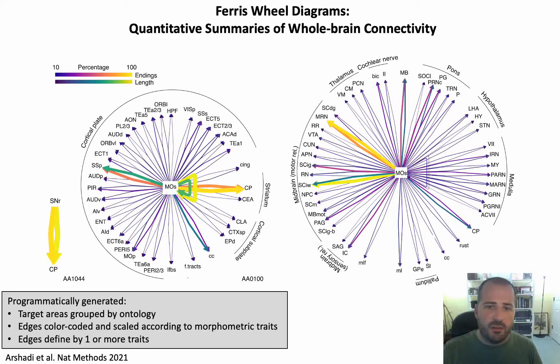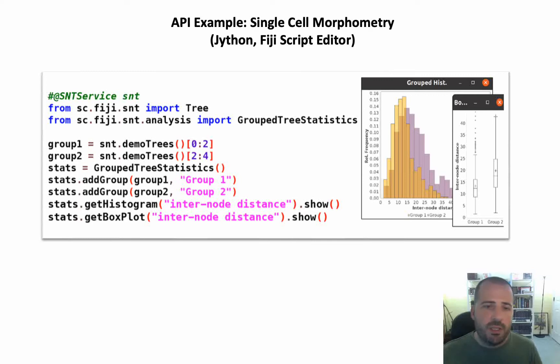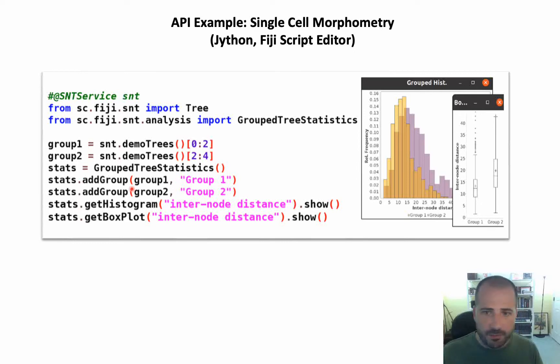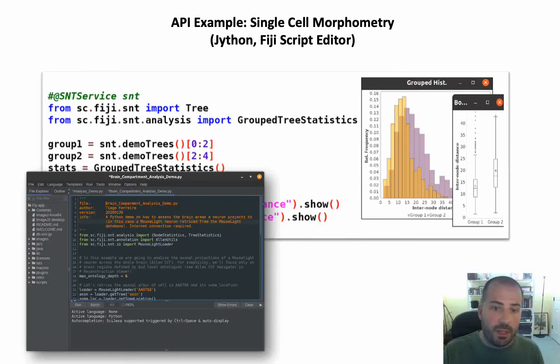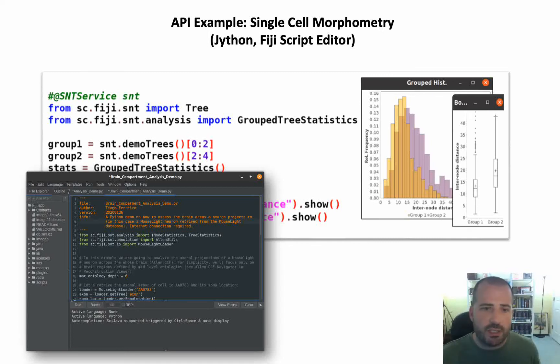All these analyses can be done from the GUI or via scripts. Let me show you how the scripting API looks. Here is a Fiji example in Jython — the code on the left as typed in the Fiji script editor, and the result on the right. You can see that we are using SciJava add-parameters, which has streamlined things quite a bit. We have also made several improvements to the Fiji script editor in the context of this work, so I would encourage you to check that out too.